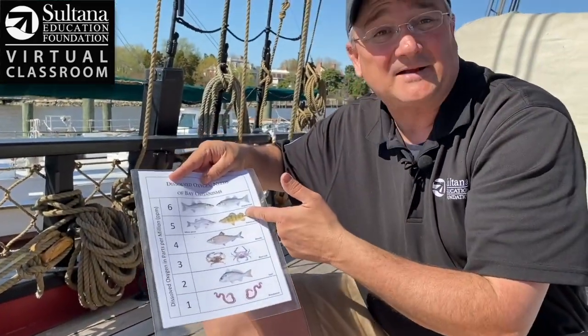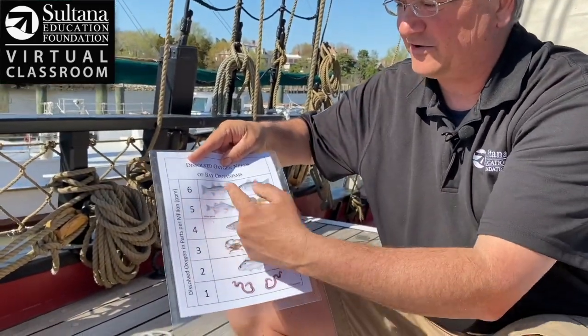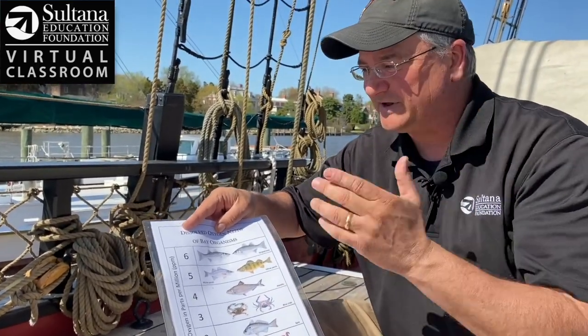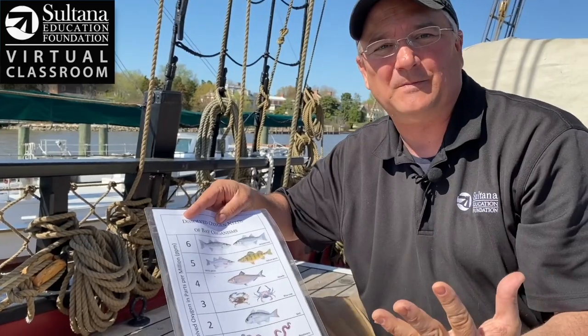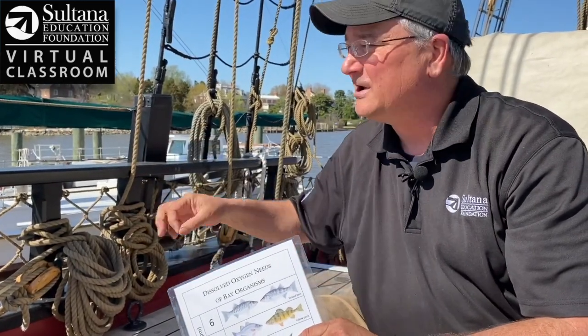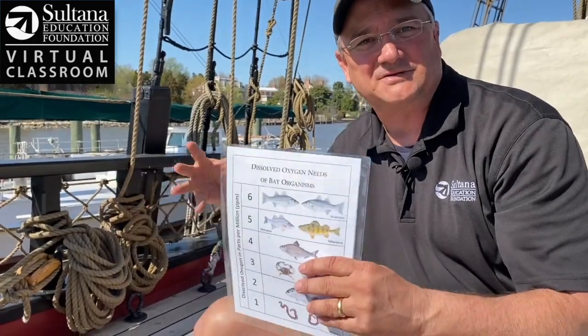Taking that result and coming back to my chart, you'll see our apex predators require at least six parts per million of dissolved oxygen in the water to thrive. Today we measured about nine parts per million. So at least today on the surface of the Chester River, we have enough dissolved oxygen to support marine life.